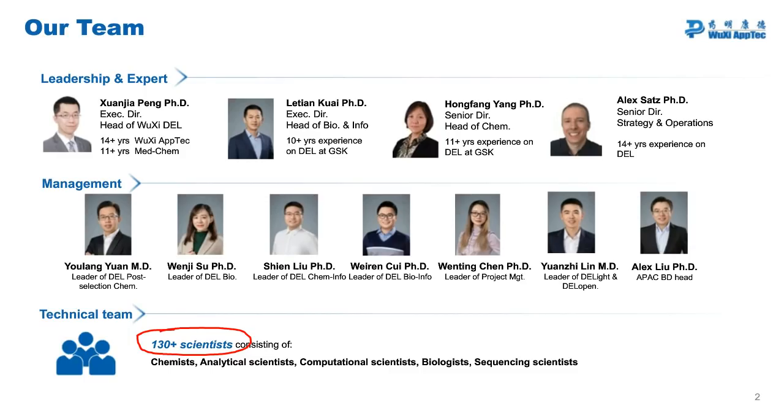Another question asks, any idea of a false positive rate? How often do compounds that show low or average enrichment turn out to actually be potent in biochemical assays? So there's sort of two different questions there. The lower your enrichment is, the higher the risk that when you resynthesize the compound it won't be active. That doesn't necessarily mean it's a false positive, though. Sometimes it's simply a very weak binder. And when you run a DEL screen, you can enrich things which are very weak binders.